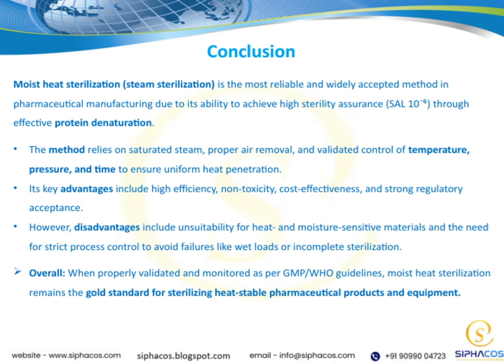Some key advantages are its high efficiency, non-toxicity, cost-effectiveness, and strong regulatory acceptance. These factors make it the preferred choice in many settings. However, it does have limitations. It's not suitable for materials that are sensitive to heat or moisture, and maintaining strict process controls is vital to prevent issues like wet loads or incomplete sterilization.